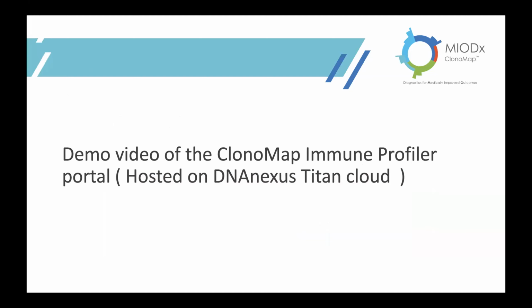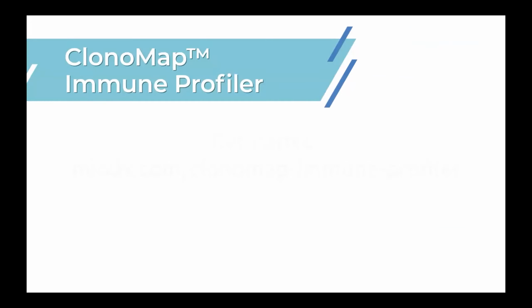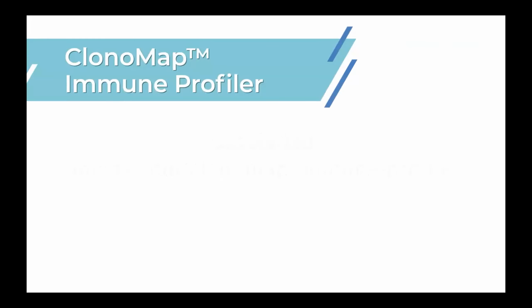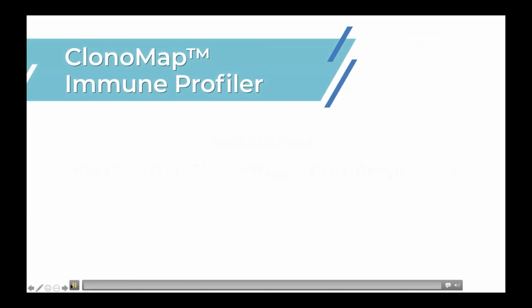We are going to be hosting the data management platform with DNA Nexus. So I hope the video is going to play. So we can access the Immune Profiler. Oops. Okay, I'm going to try and play the video here.